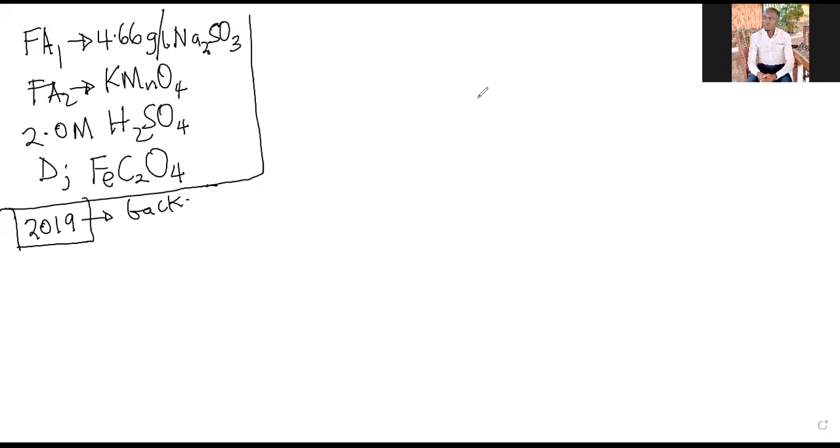So they are telling us that we use a measuring cylinder, transfer 25 of FA1.